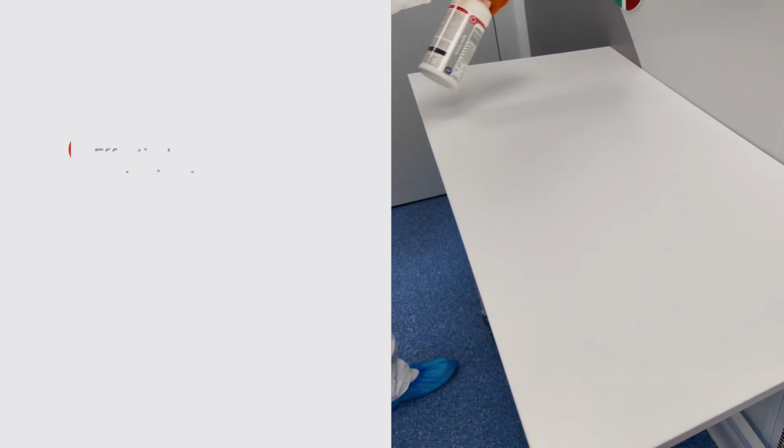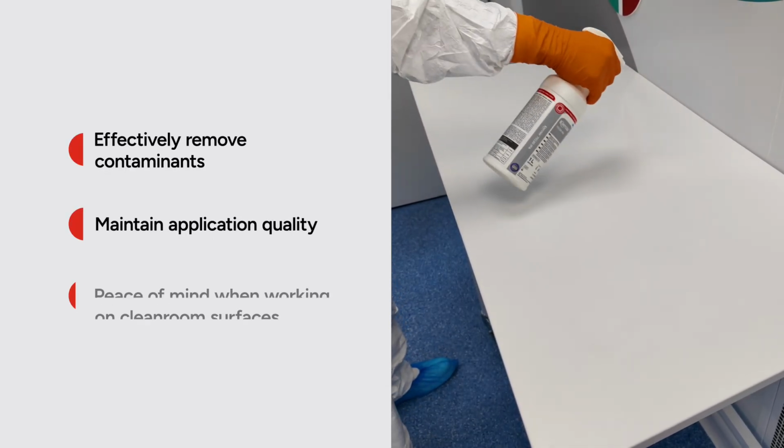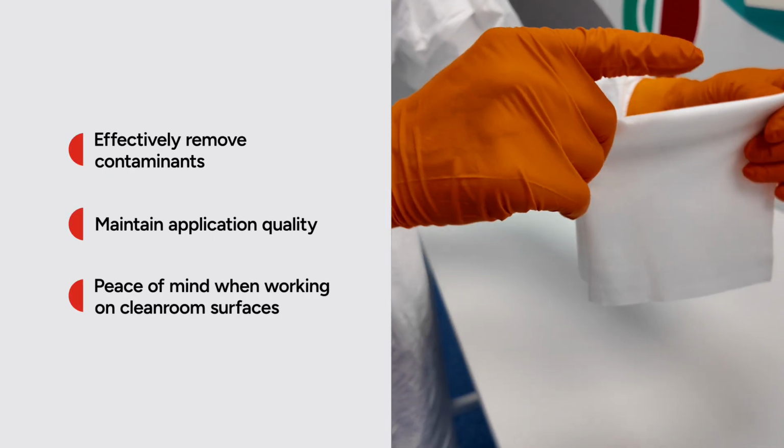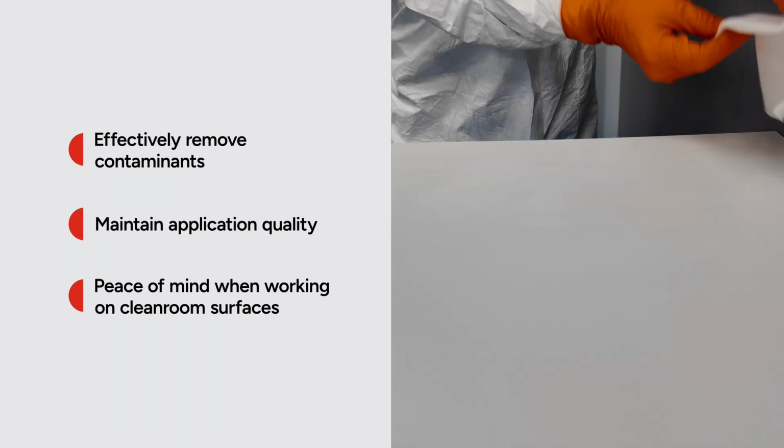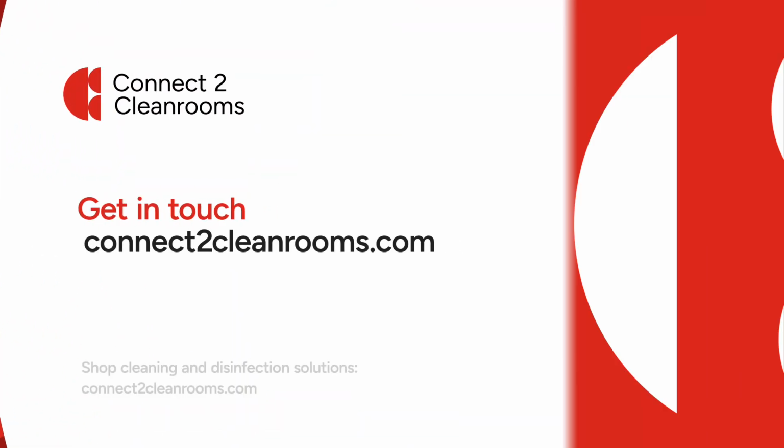So by utilising the correct methods and products for your controlled environment, you'll effectively remove contaminants from your workstations, maintaining application quality and have peace of mind when working on these surfaces.